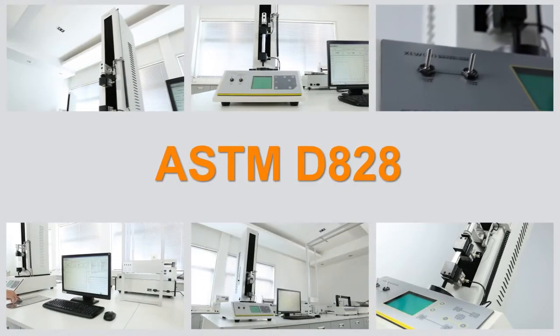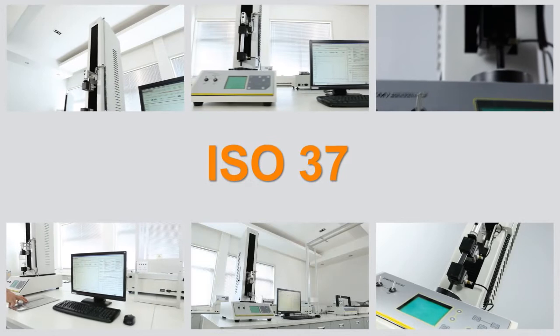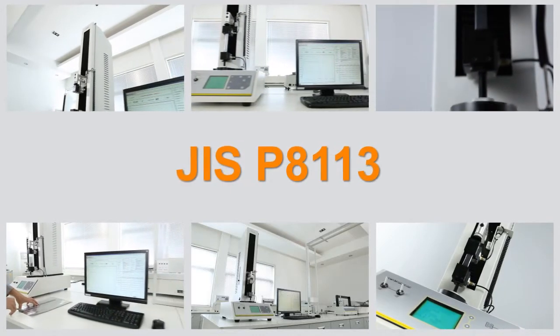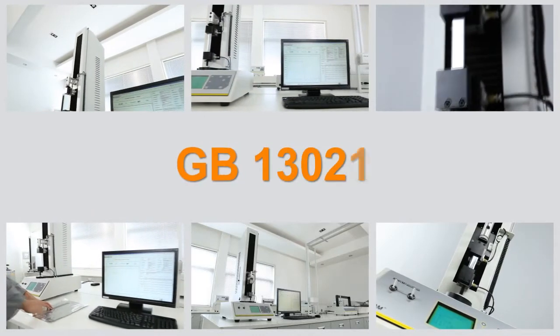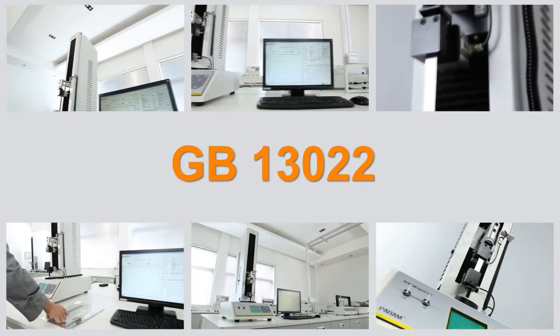The testing principle complies with ASTM D828, ISO 37, JIS P8113, GB 13022, and other standards.